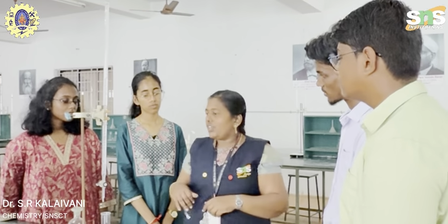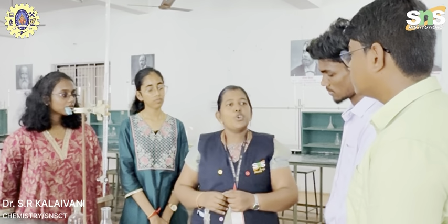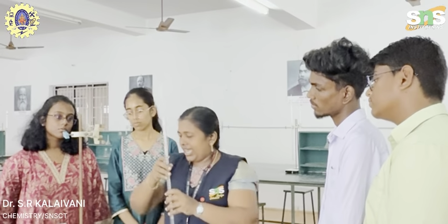Then again we will do the second titration. Our second titration aim is estimation of total hardness. Same method. The burette solution is the same, EDTA.